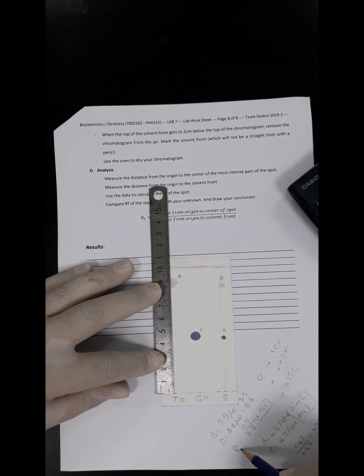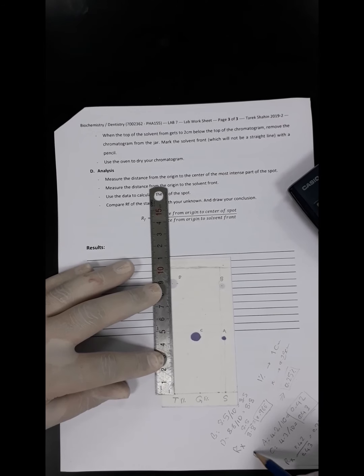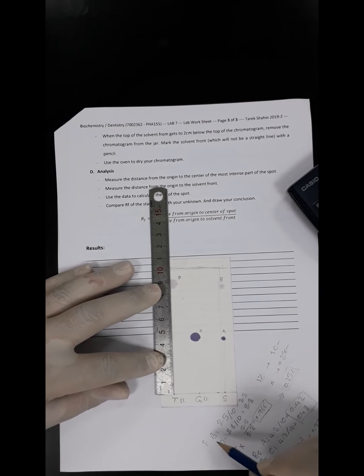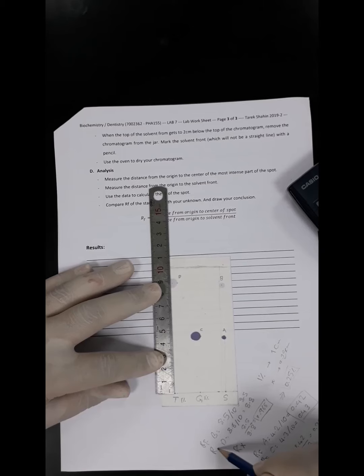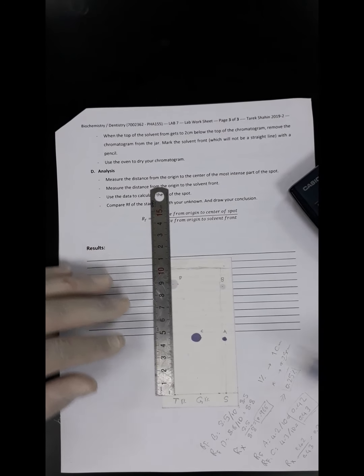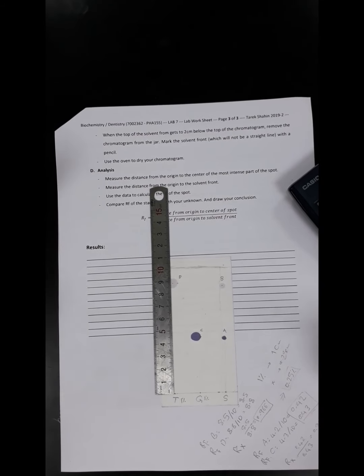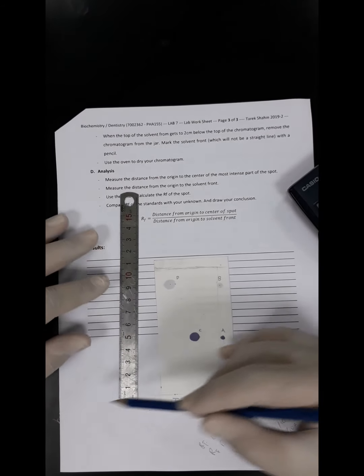This calculation we call the retardation fraction, and this again we call a retardation fraction, while this calculation we call the retardation factor, for spot A, spot C, spot B, and spot D. So now we know the retardation factors and retardation fractions, and we can use all these digits to identify the spots and get an idea about the nature of these spots, whether they are glycine, tyrosine, or any other amino acids.